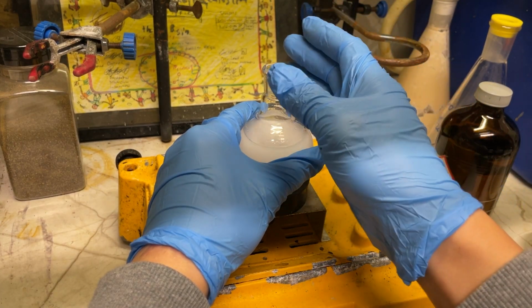So we have our borohydride here, and it undergoes protonolysis by acetic acid to yield us borane, which is weird. And then the borane can undergo attack by the lone pair on the oxygen on acetate to yield us sodium acetoxyborohydride. And then that process repeats itself two more times to yield us the triacetoxy compound. You can also get di- and tetraacetoxy, but those will not really be in solution there. And here's the hydrogen formation.